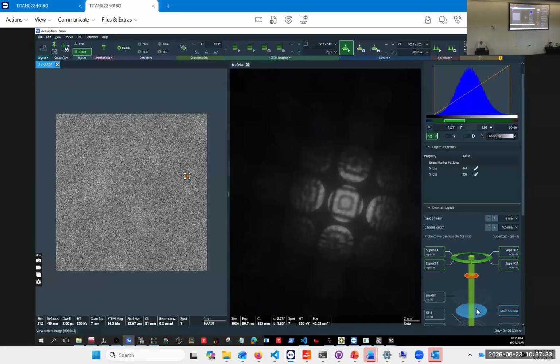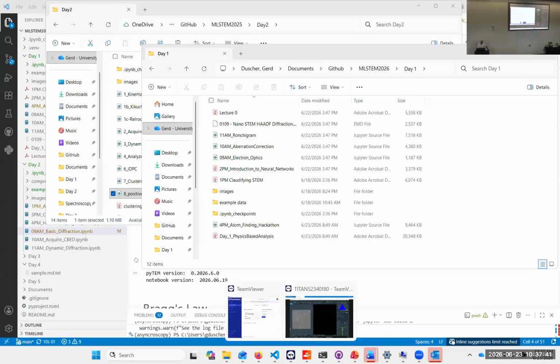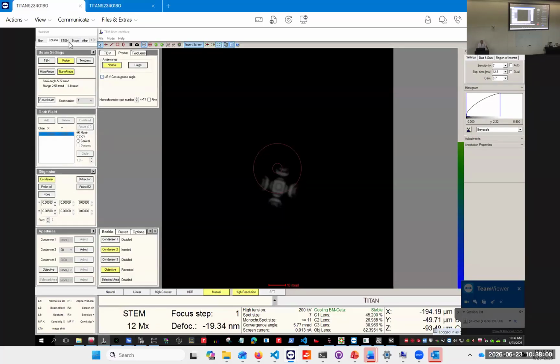Get really rid of this thing here. Okay. First of all, we now have a diffraction shift on our part. I still have my column, so I undo this one.